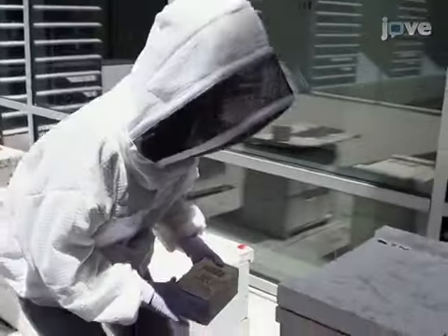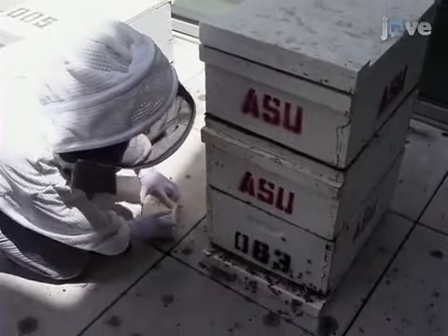To begin, collect worker bees from the entrance to the colony as they pause before departing or as they return.